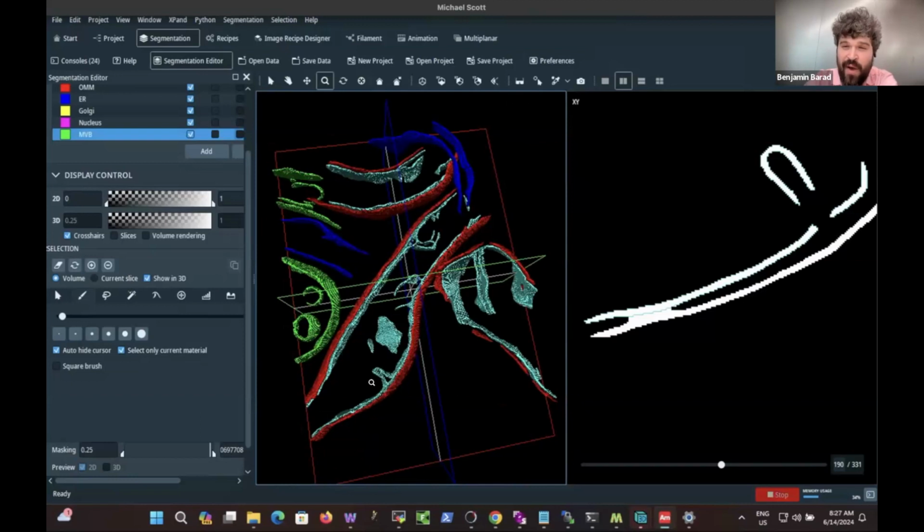We end up spending about 20 minutes to half an hour per tomogram when you're sitting and working really efficiently, which I was doing an okay job of today. And so, if you're thinking about segmenting hundreds of tomograms, it becomes a couple of weeks of work to do that now. And it's to the point where you can really start thinking about doing this at large scale.